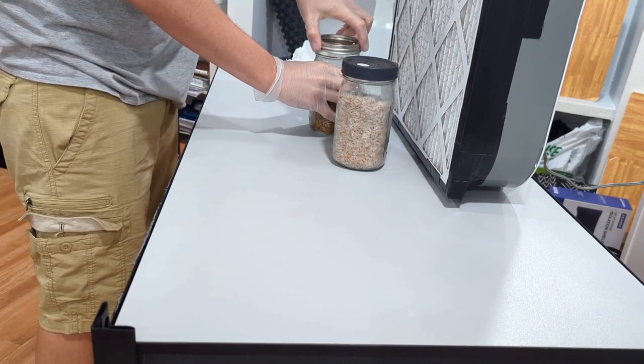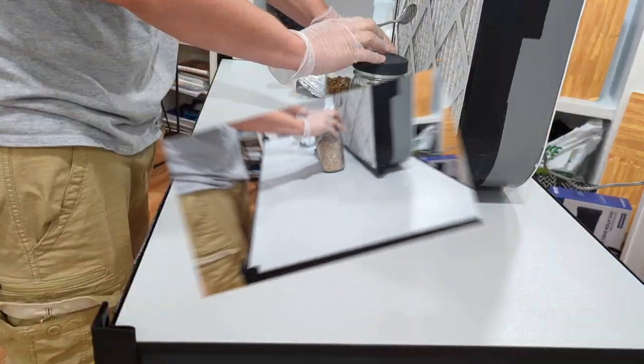Get your receiving jar ready to go and pop it open in front of the flow hood.